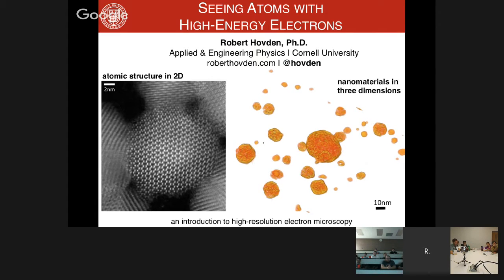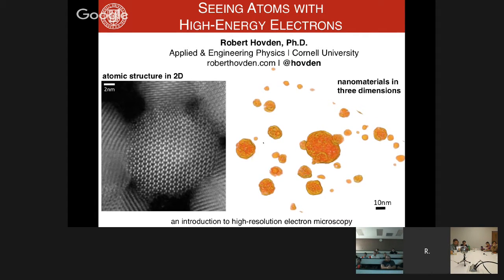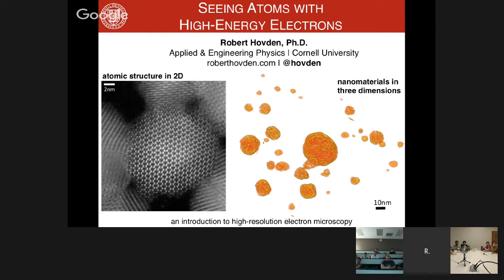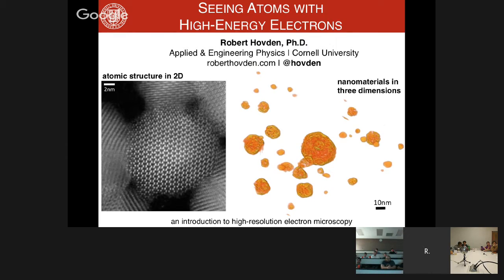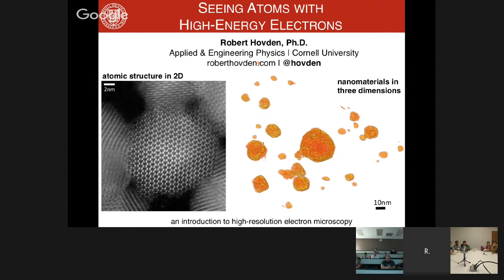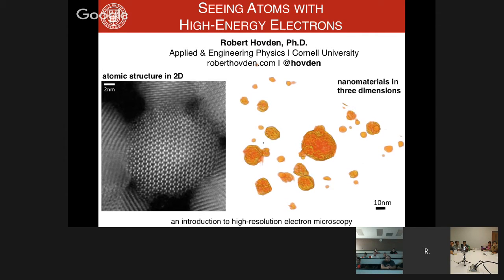The picture on the left is a picture of a nanoparticle. The nanoparticle's roughly 20 nanometers in diameter. In the center, you'll also see spots in the nanoparticle. These spots are the atoms that make up the particle. You can see that these atoms are very well organized in a repeating pattern, which is what defines a crystal. So I'd actually call this nanoparticle a nanocrystal.